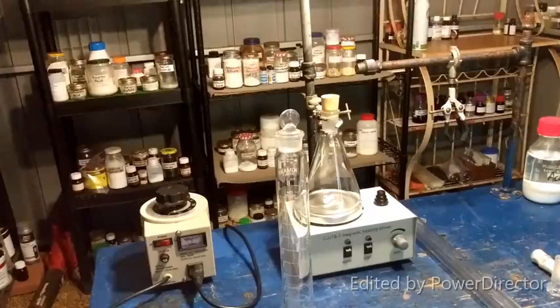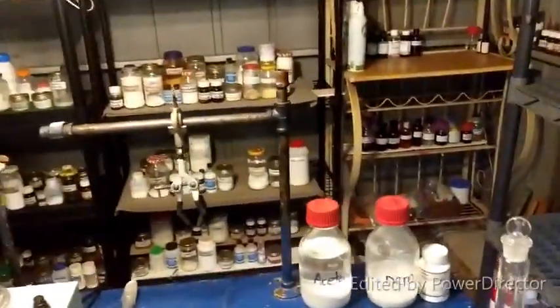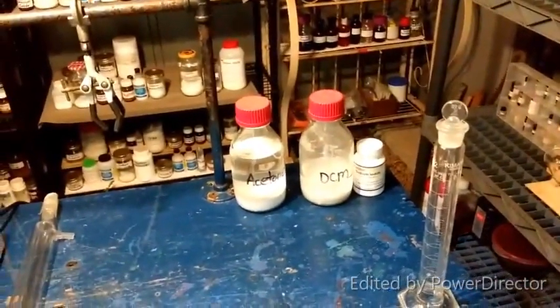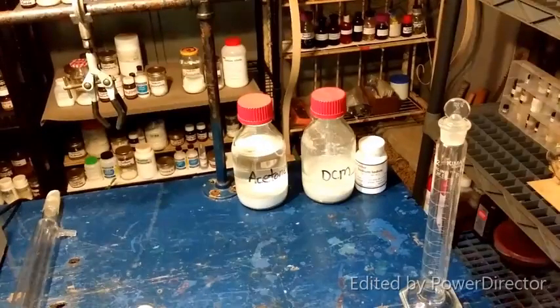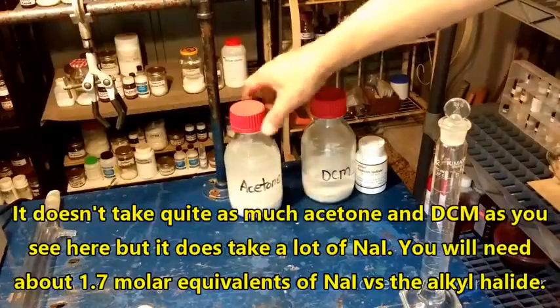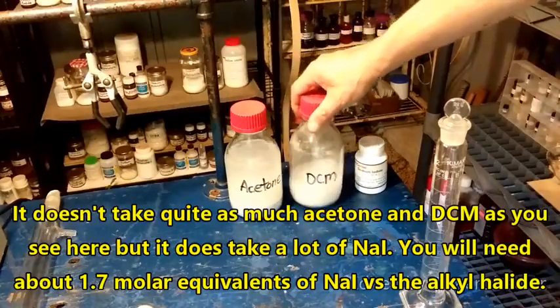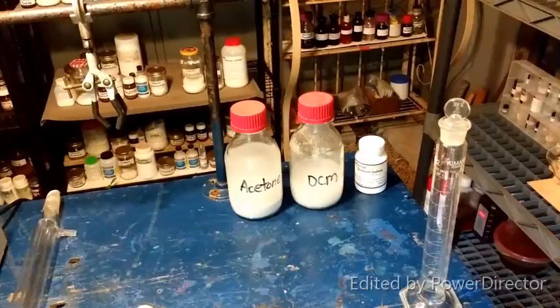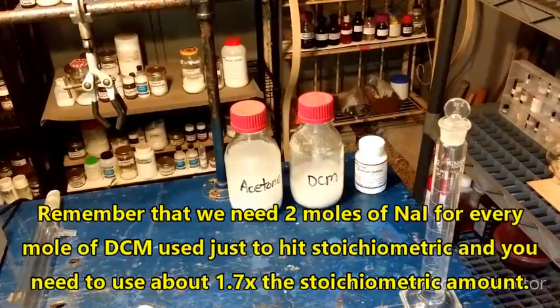So anyway, I want to try to be very careful with this because it takes a lot of chemicals to do this, and I'll show you what I mean. So here we've got our dried acetone, dichloromethane, and sodium iodide. These have been dried over magnesium sulfate. You can see there is plenty in there. We do not have any kind of clumpification going on. Well, we do, but it's at the bottom. So the solvents are dry.